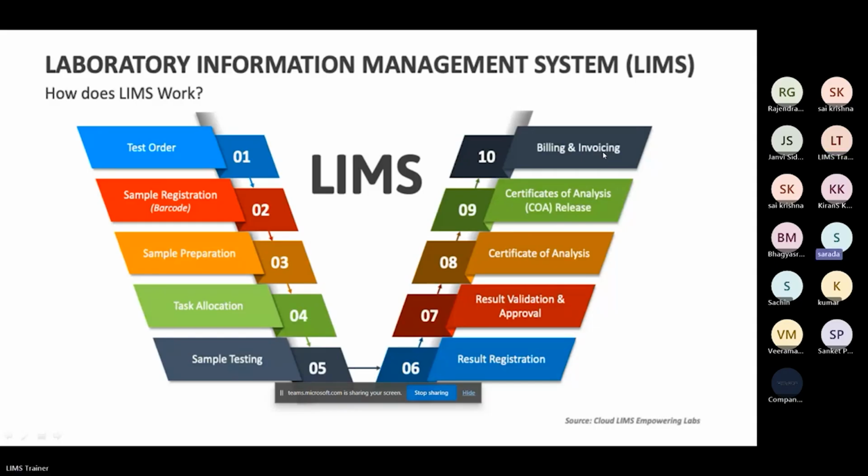Any questions here? No, sir. Actually, I understand this is related to hospital. Can you explain, in industry, we are not doing billing, invoicing? See, I can see the first stage, that is test order, will not be there in industry, and the last one, that is billing and invoicing, will not be included in your company laboratory. The other functionality will go in that flow.